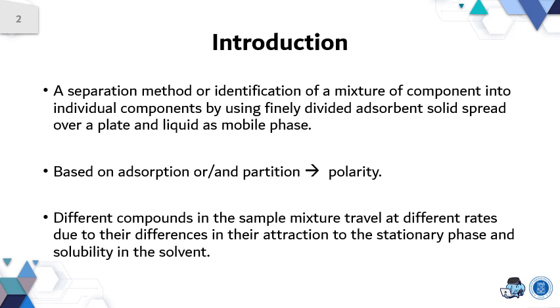If we talk about TLC, it is all about the polarity of the compound and also the mobile phase. Different compounds in the sample mixture travel at different rates due to their differences in attraction to the stationary phase and solubility in the solvent.